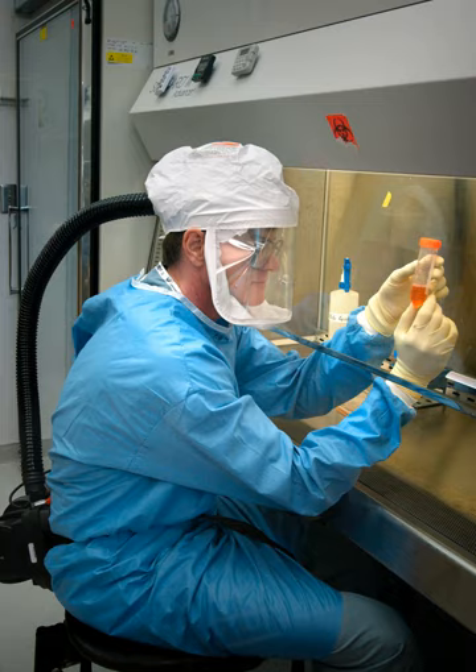The Class III cabinet, generally only installed in maximum containment laboratories, is specifically designed for work with BSL-4 pathogenic agents, providing maximum protection. The enclosure is gas-tight, and all materials enter and leave through a dunk tank or double-door autoclave. Gloves attached to the front prevent direct contact with hazardous materials. Class III cabinets are sometimes called glove boxes. These custom-built cabinets often attach into a line, and the lab equipment installed inside is usually custom-built as well.